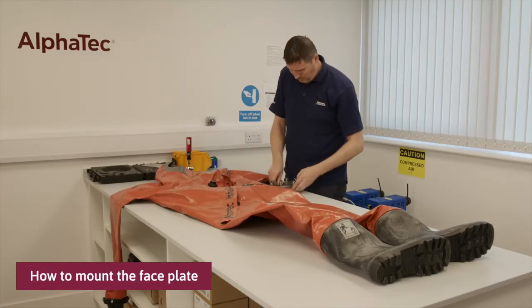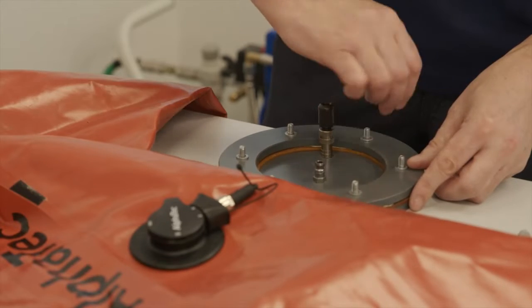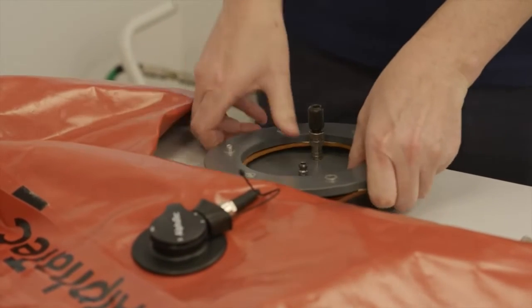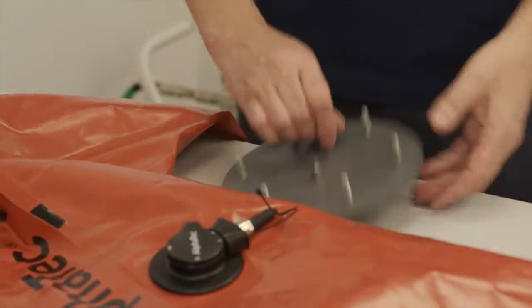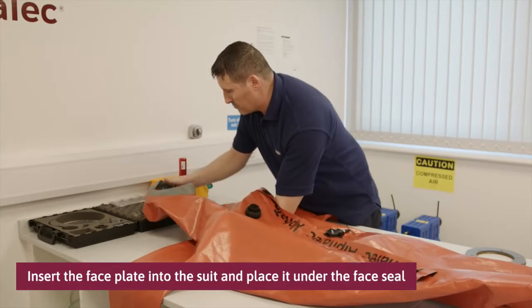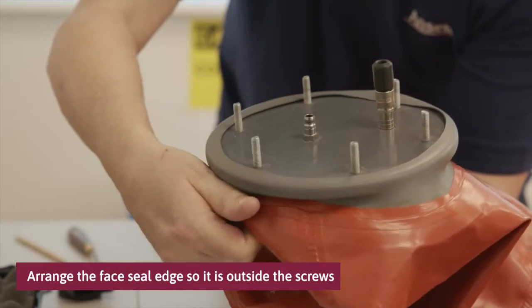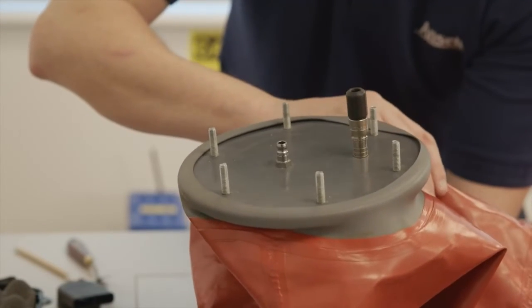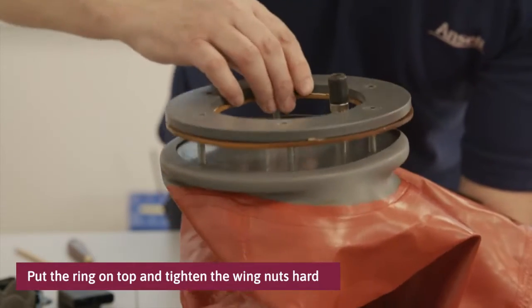This is how to mount the faceplate. First unscrew the wing nuts and separate the upper ring from the bottom plate. Insert the faceplate into the suit and place it under the face seal. Arrange the face seal edge so it is outside the screws and not in contact with the screws, as this would risk damaging the face seal when sealing. Put the ring on top and tighten the wing nuts hard.